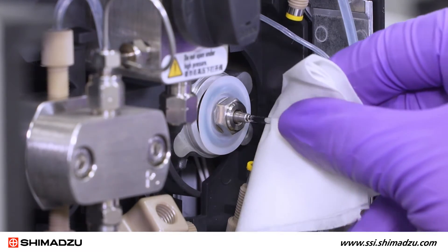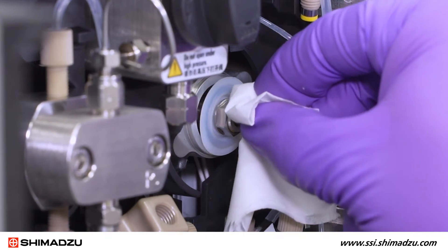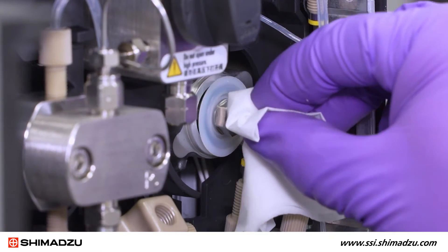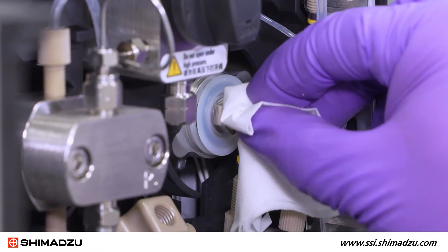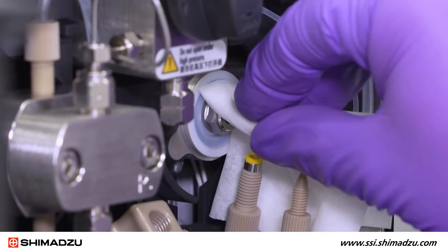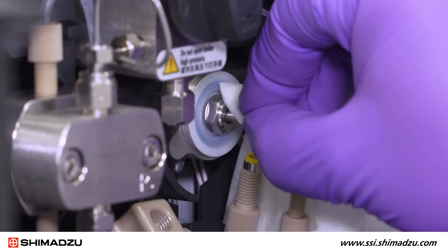Hold the tip of the plunger with two fingers and a kimwipe and move it up, down, right, left, clockwise and counterclockwise to spread the grease evenly to the rear end of the plunger holder. Clean off the plunger surface with a kimwipe and isopropanol.